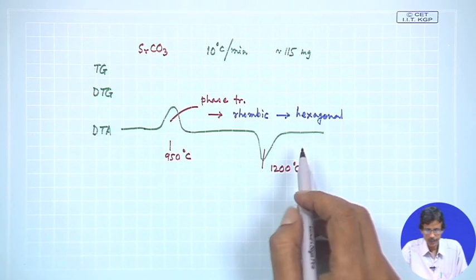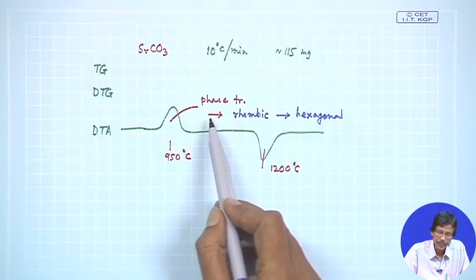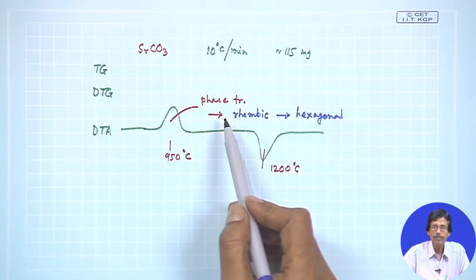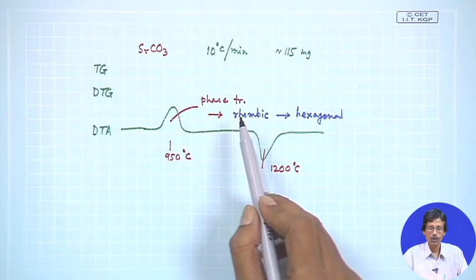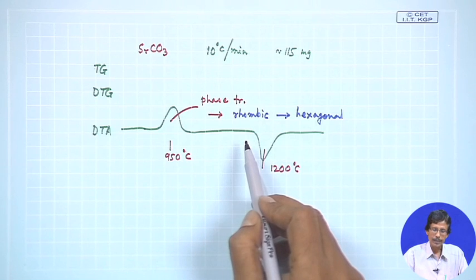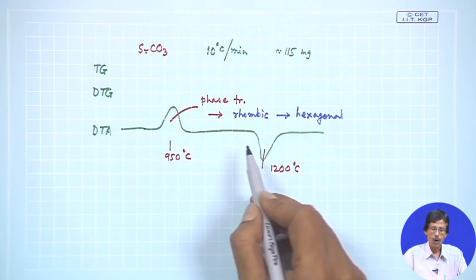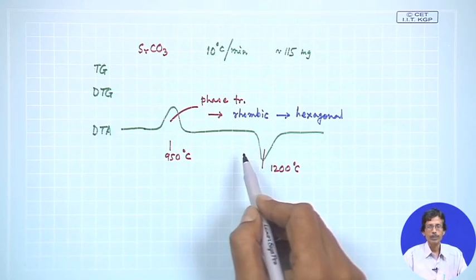So, that is why we see that DTA is not only giving rise to the different types of gases coming out from the sample and how they burn, but most interestingly this phase transition. From any material, any inorganic glass sample or inorganic solid material or rubber-like polymer material, we can identify this particular phase transition, because we know that in polymer analysis we can have the corresponding glass transition temperature Tg, then we can have the crystallization temperature; all we can study by this particular useful technique. Okay, thank you very much.